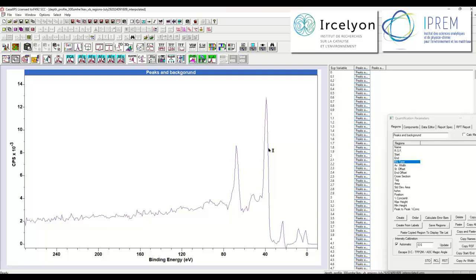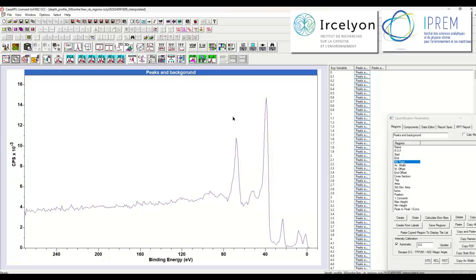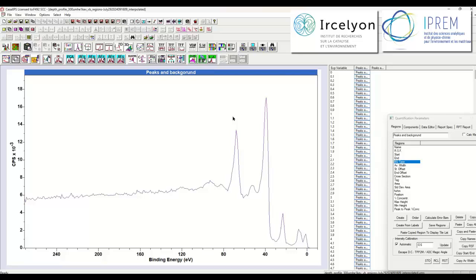This is vanadium. It's a vanadium foil with adventitious material and native oxide. So it's not surprising that we find something that is in a reduced form, as beneath the surface is the metallic form of vanadium. But I need to carry on going because it's not quite fully reduced. We haven't got through to the metal.